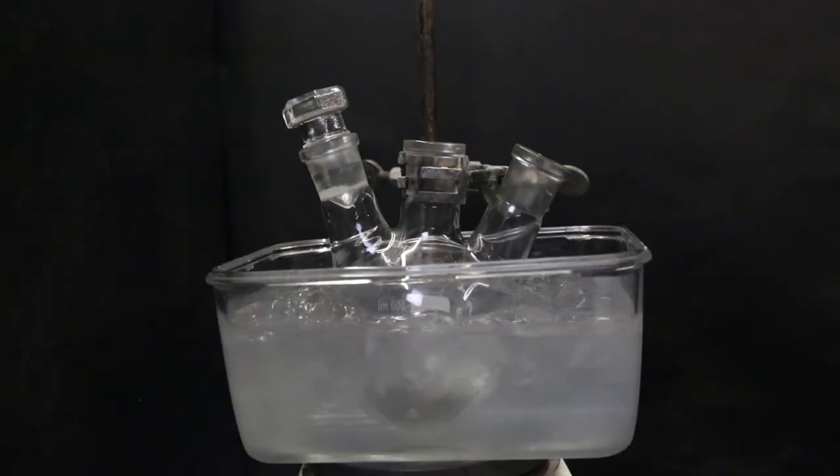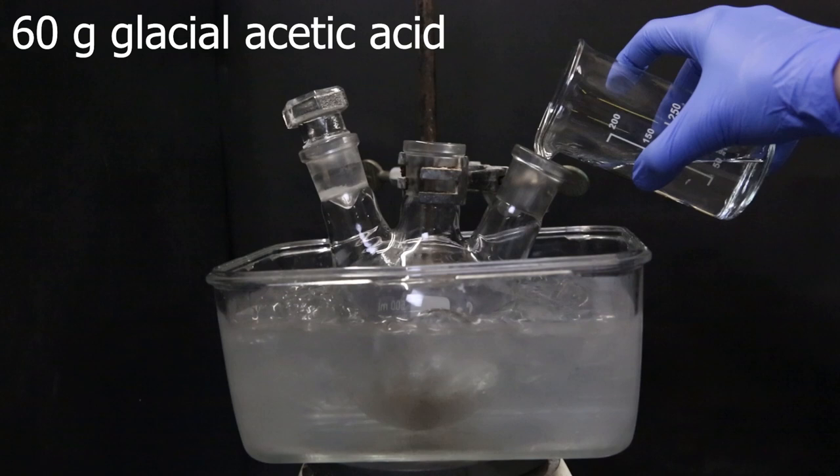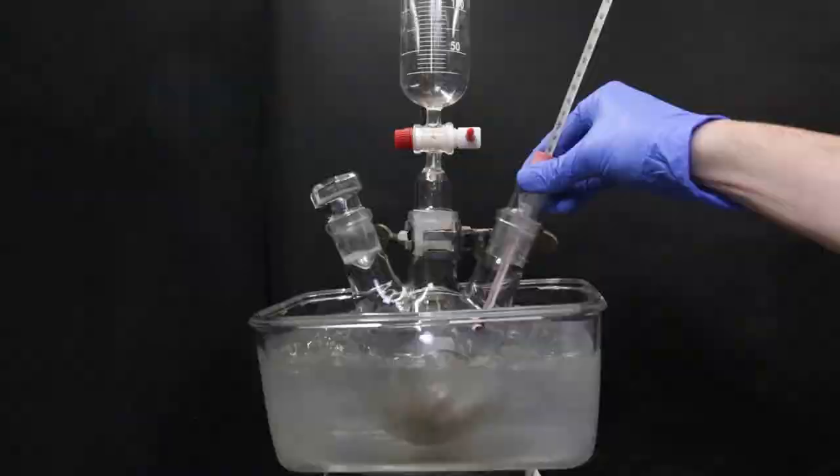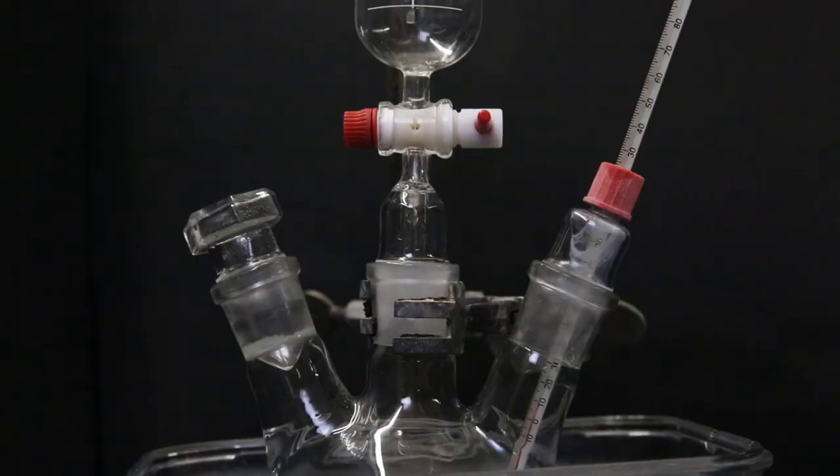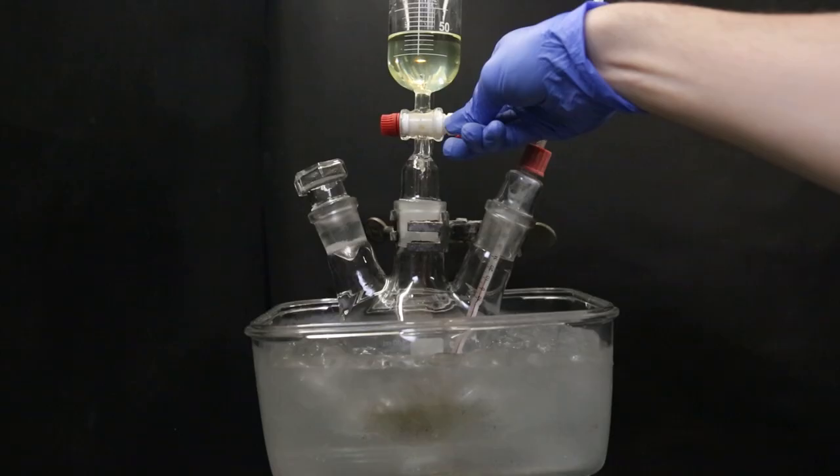Now the next step is to make the ionone, which is the final product. So I set up a flask in an ice bath and drop in a stir bar. I then add in 145 grams of concentrated sulfuric acid and 60 grams of glacial acetic acid. Then I attach a dropping funnel and a thermometer adapter and wait for the mixture to cool down to 10C. While waiting, I add in all of the pseudo-ionone from before to the dropping funnel. And when the temperature has reached 10C, I slowly drop in the pseudo-ionone and maintain the temperature between 10 and 15C.